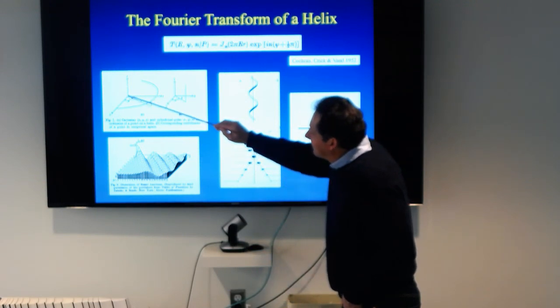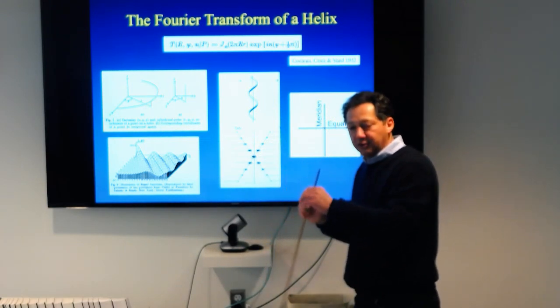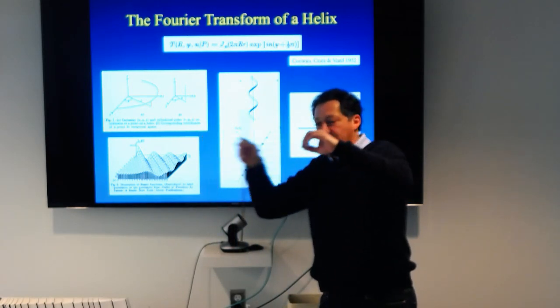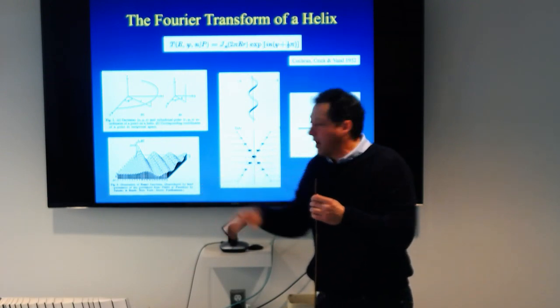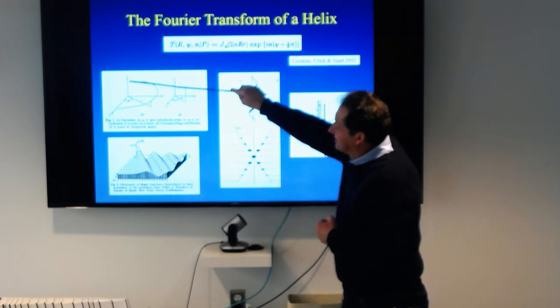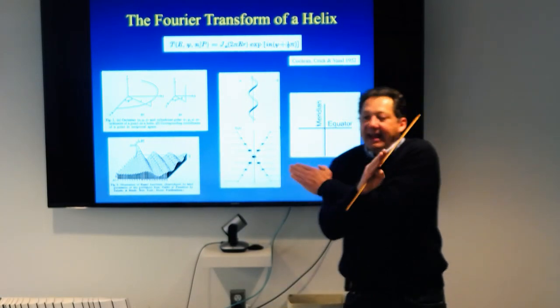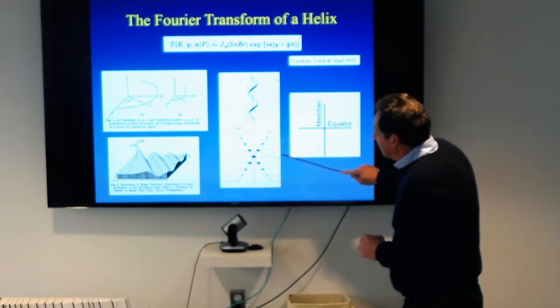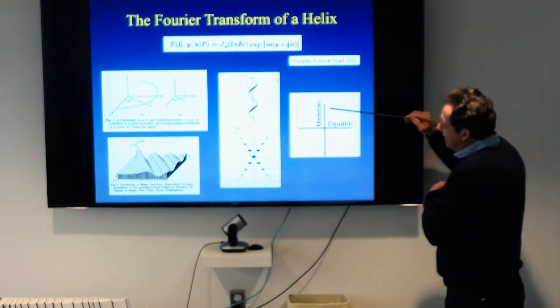So you will have a Bessel order 0 here that will be at the origin of your diffraction pattern. You're going to have a high peak, and then as you go further out, it's like a damped sinusoidal wave. And as you go along the axis of the helix, you get other Bessel orders. So the pattern looks like an X, okay, in which you have a peak at the center and subsidiary peaks coming like that. And before I continue, let's define two other terms.